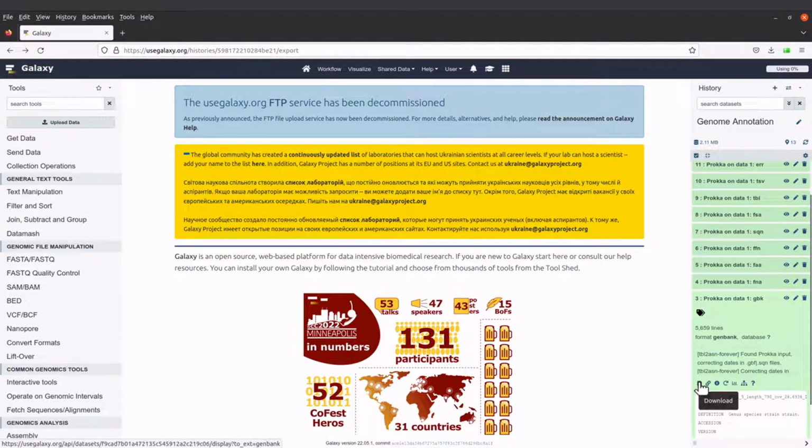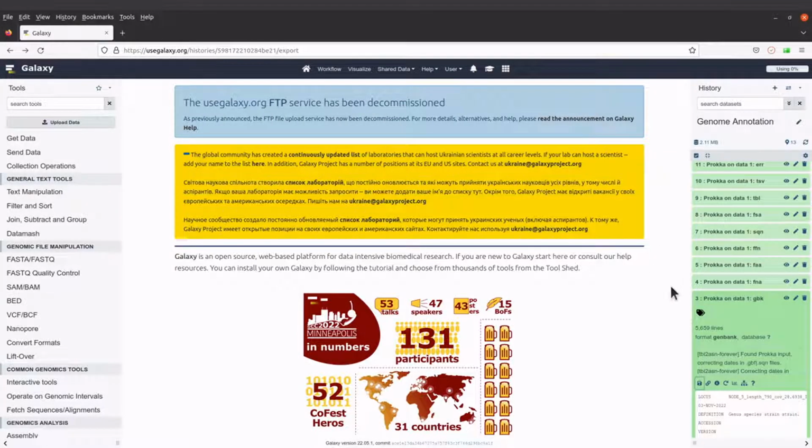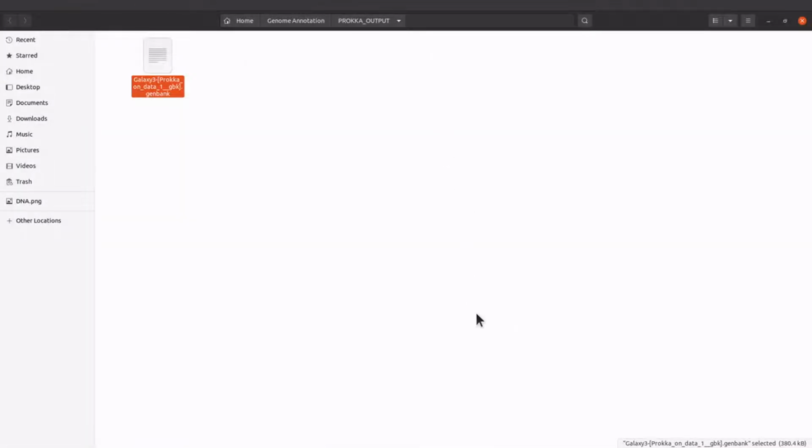You look for the save icon, this one. If you hover your mouse on it, the download text will show. So this is the right button. You can click it, and then you can save it. Before you save, you can rename the files. For the names of the files, I will leave that to you. So I'll save the file. Okay, that has been done. So I can check the file here in my directory. So this is a file.